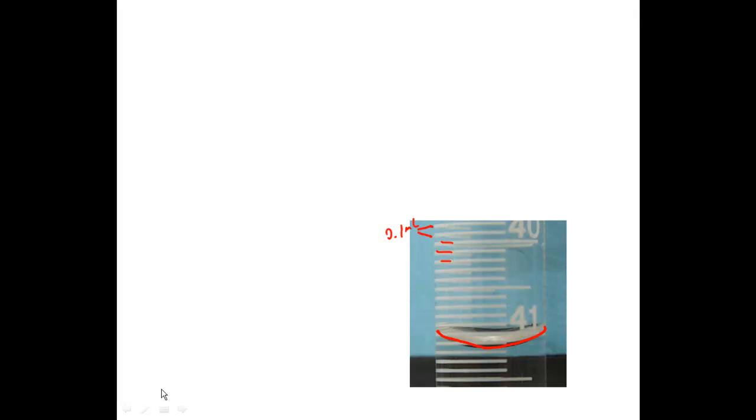So in this one, I'm looking at this. I can see I'm past 41.1, that's where 41.1 is, and this is 41.2. So I'm somewhere between 41.1 and 41.2.